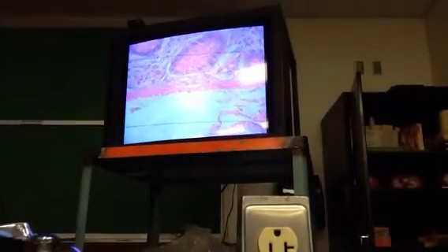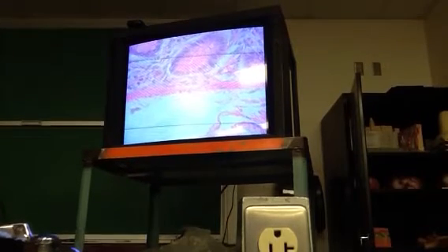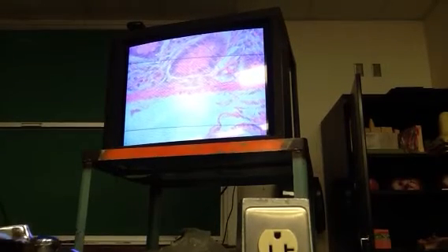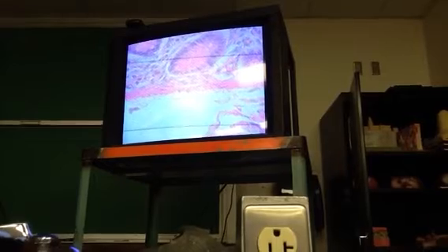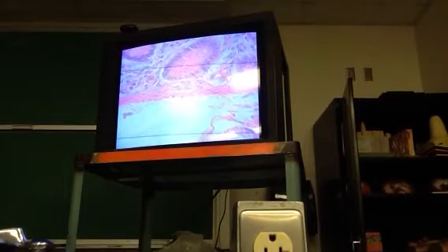At low magnification, I can ask which tunic is this, ask about villi, ask about intestinal glands, things like that, muscularis mucosae, lamina propria. When we get to higher magnification, we'll go to goblet cells. Peyer's patches are best seen at scanning, they're huge. Brunner's glands, yeah. Okay.